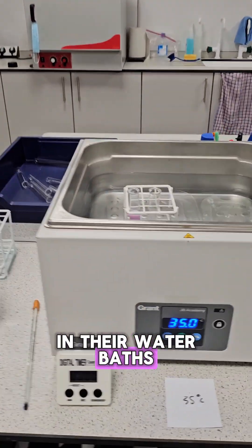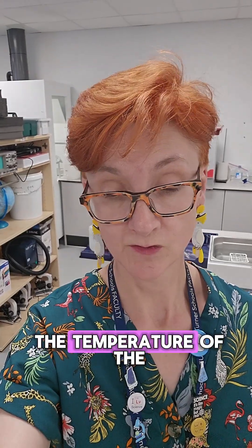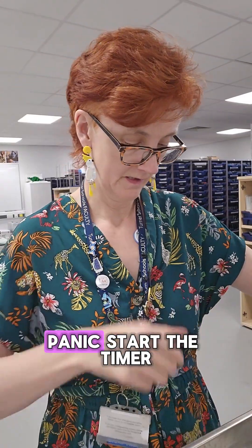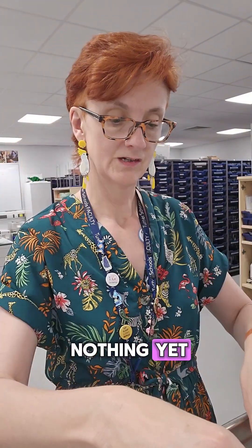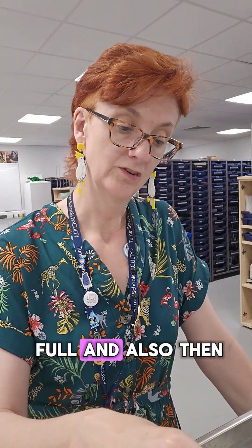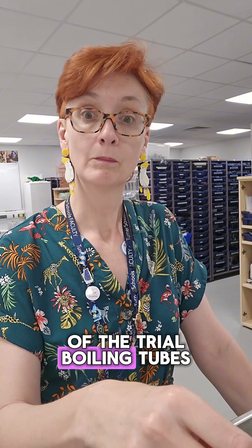Now they're all in their water baths. We just wait till they get to the temperature of the water baths. So we're going to add one mil — start the timer, started. And now stir. Nothing yet. It strikes me these might be better in boiling tubes because they are very full, and also then you'd be able to stir them. So that's point one of the trial: boiling tubes.